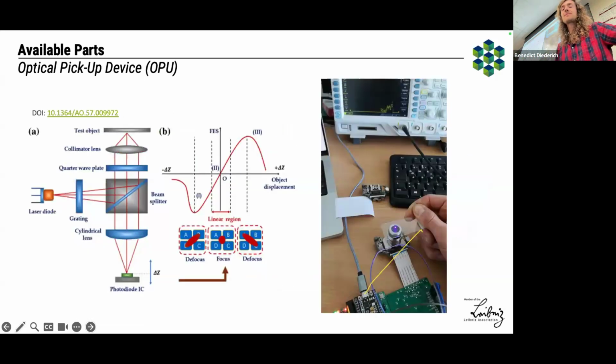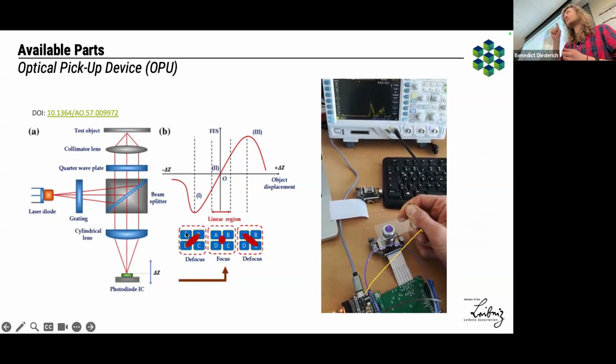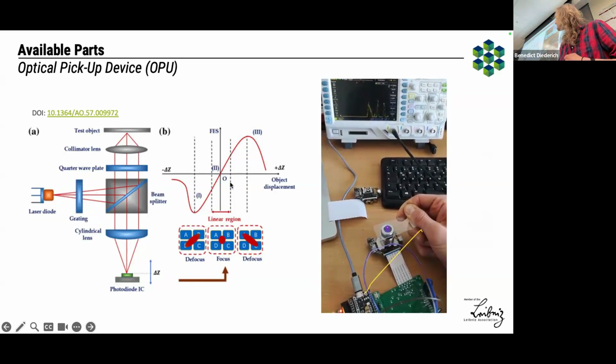And this is something we also did once in a while. You see the optical diagram here. The way it works is you have the one lens that is facing the DVD, the beam splitters, and then the detector and the laser diode. The detector itself can also sense the distance between this lens and the DVD in order to focus it such that you minimize the focus spot. The way it's done is using a quadrant diode. A quadrant diode is basically a very, very simple camera with just 4 pixels. Then you do a very simple mathematical formulation.